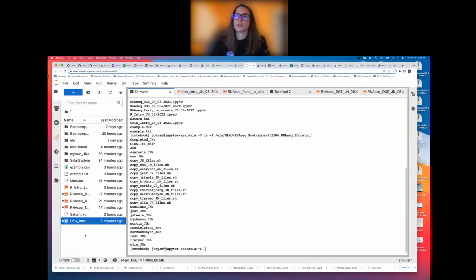Yeah, so all your students would only be working in their own home directory. We want to keep them blind to this location so that they don't start messing with things. So your students would only be printing out to their home location, and then they can of course download things locally from home. So this is only for you guys as educators. That way you can save your modified versions and make them accessible to your students.